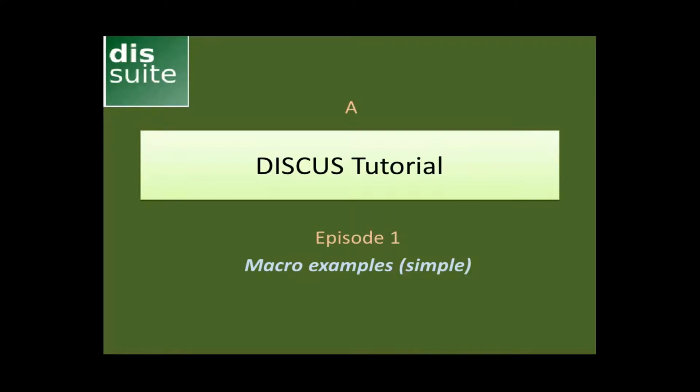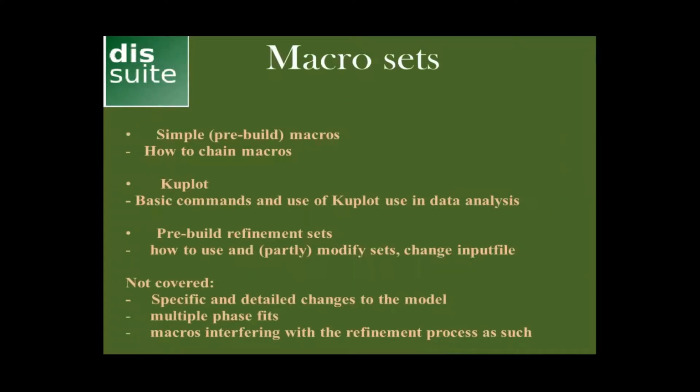Welcome everybody to another Discus tutorial. Today we're going to talk about macros in Discus. This tutorial will pretty much continue from the last tutorial, where you've seen what Discus is able to do in general. Today we are going to talk about how you can actually achieve those ideas in Discus.